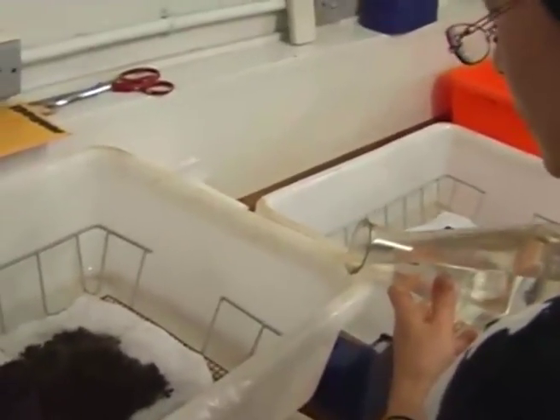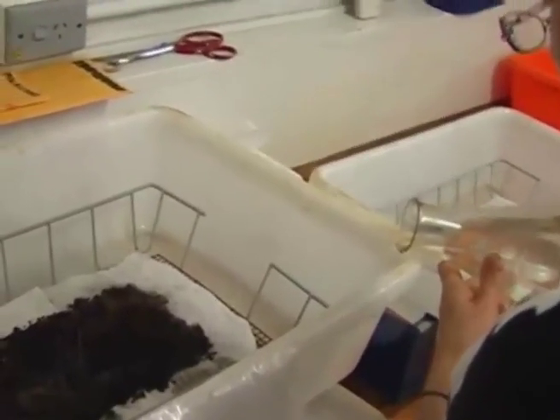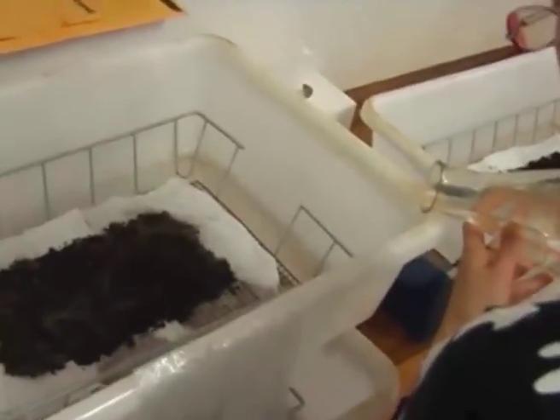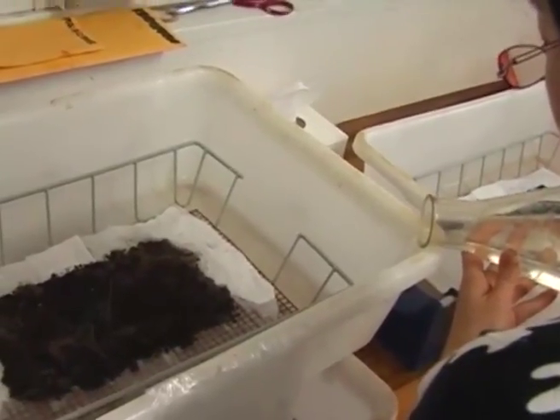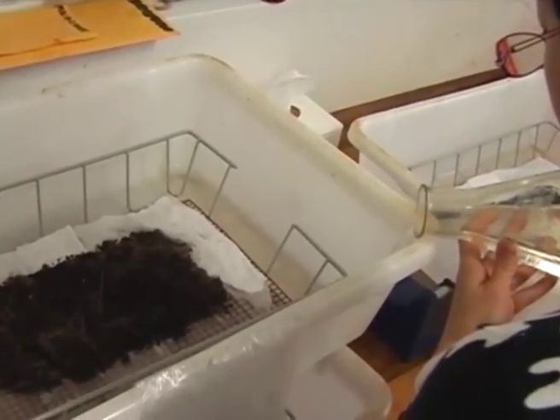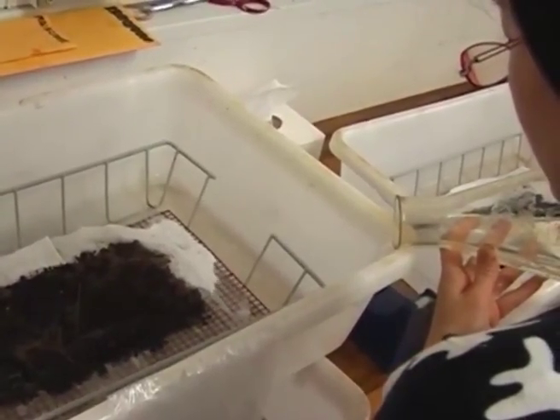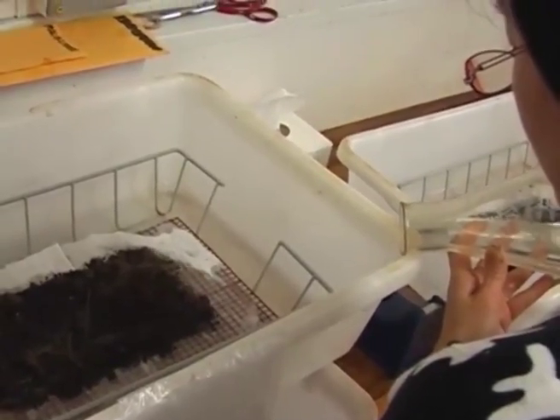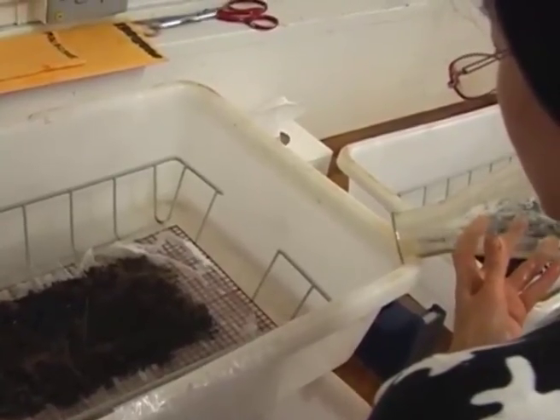Suitable mesh is placed in the tray and its sides are covered with a single sheet of kitchen paper. Then a thin uniform layer of soil is spread over the paper. Now clean water is poured gently into the tray until the soil is wet but not submerged. Spillage of soil particles along the side is avoided, as they cloud up the extract and make it tedious to observe the nematodes. The setup is left undisturbed until the next day.